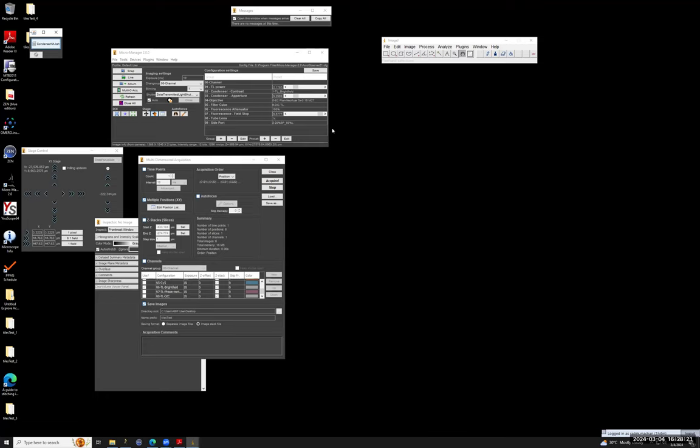for the fluorescent channels. But this is not the case in Micromanager. Here, unfortunately, there are no blue and gray settings. So each channel has its explicit settings. So if my fluorescent channel has some setting of the transmitted light voltage, well, when it goes to that channel, it will change the voltage to that setting.